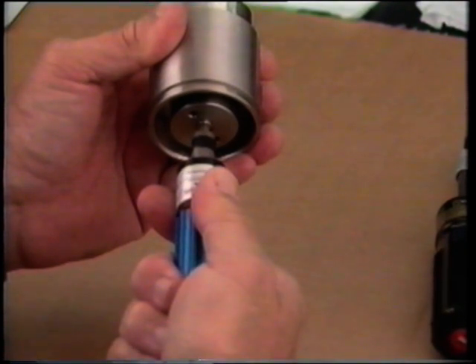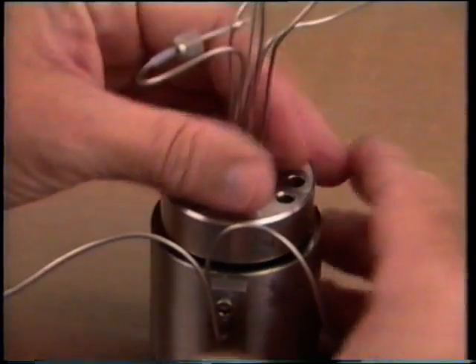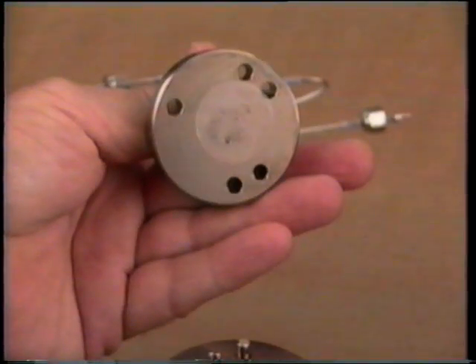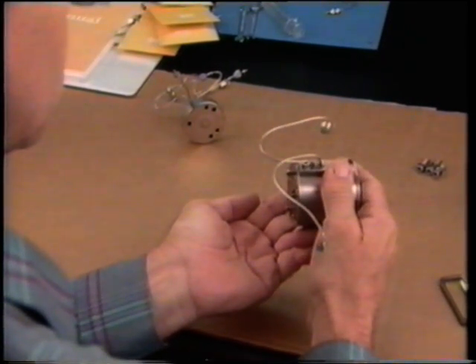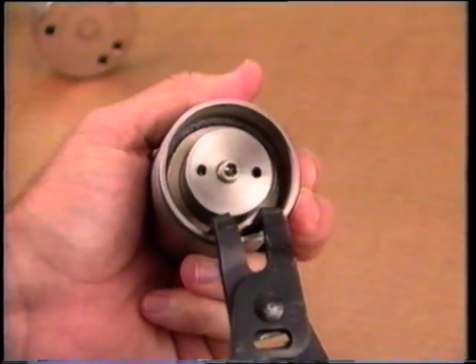In this example, relieve the pressure on the base screw and remove the 3 socket head screws. Remove the sealing and cushion discs. To remove the plungers, invert the valve body and shake it so that the plungers fall into the palm of your hand. If the plungers are stuck, wait until after the pistons are removed, then push them out from the bottom. Remove the manifold and the retaining ring.